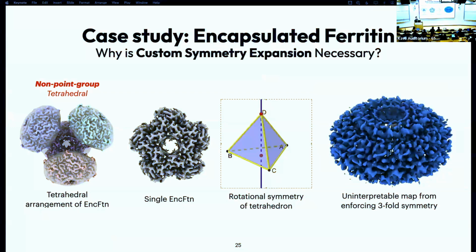I also tried running tetrahedral symmetry on the full structure. And even refining it resulted in the same thing, stuck at low resolution, with all secondary structure pretty much gone. So at this point, I could reasonably confidently dismiss the idea of it having tetrahedral symmetry.